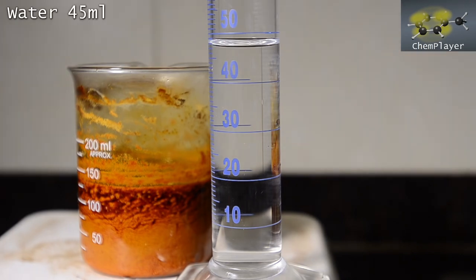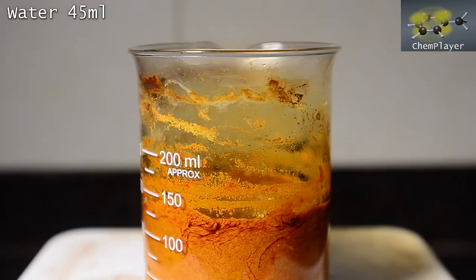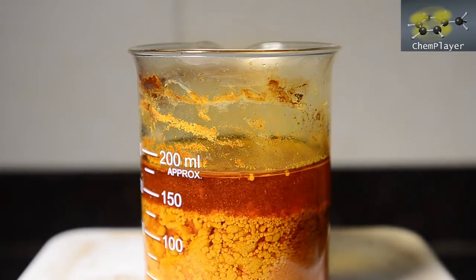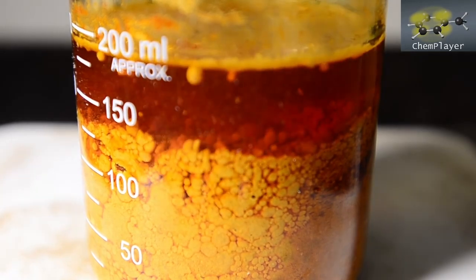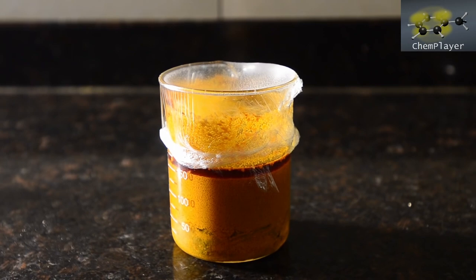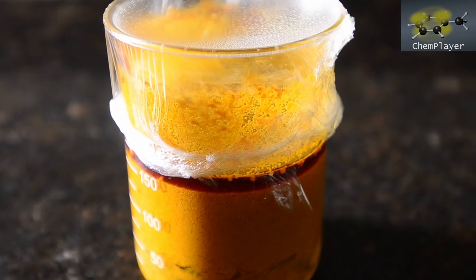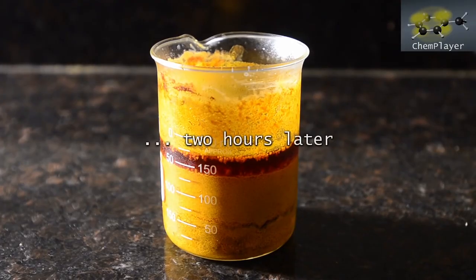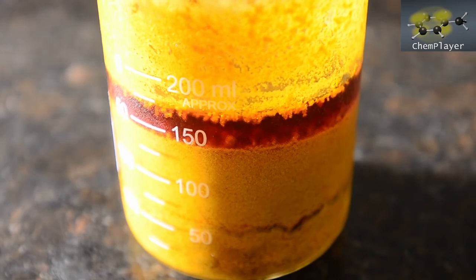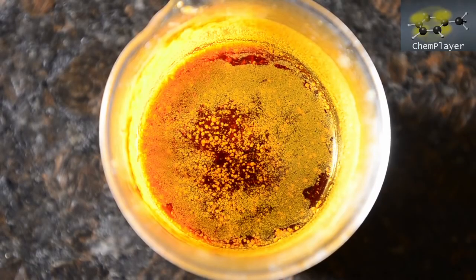Next we measured out 45 ml of water and added this to the mixture, then chilled it down in the fridge for a couple of hours. It's certainly a very pretty reaction mixture. After 2 hours of chilling, quite a bit more precipitate has formed in the bottom DCM layer, so we're going to filter this now and see what we've got.